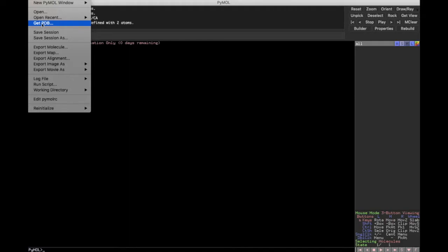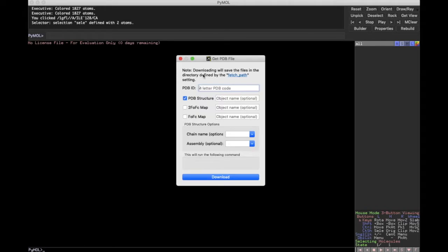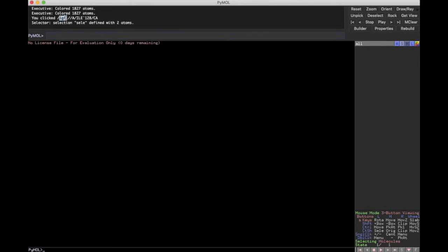All right, so I'm going to start by clicking on this one here, and it opens up this dialog where you can actually put in a PDB ID. All right, now what is that? So I previously had opened the file just to keep the code here, but when we originally were looking on the PDB website and we were looking at the green fluorescent protein, you may have noticed that there was a 4-letter alphanumeric code that was also next to that molecule's description.